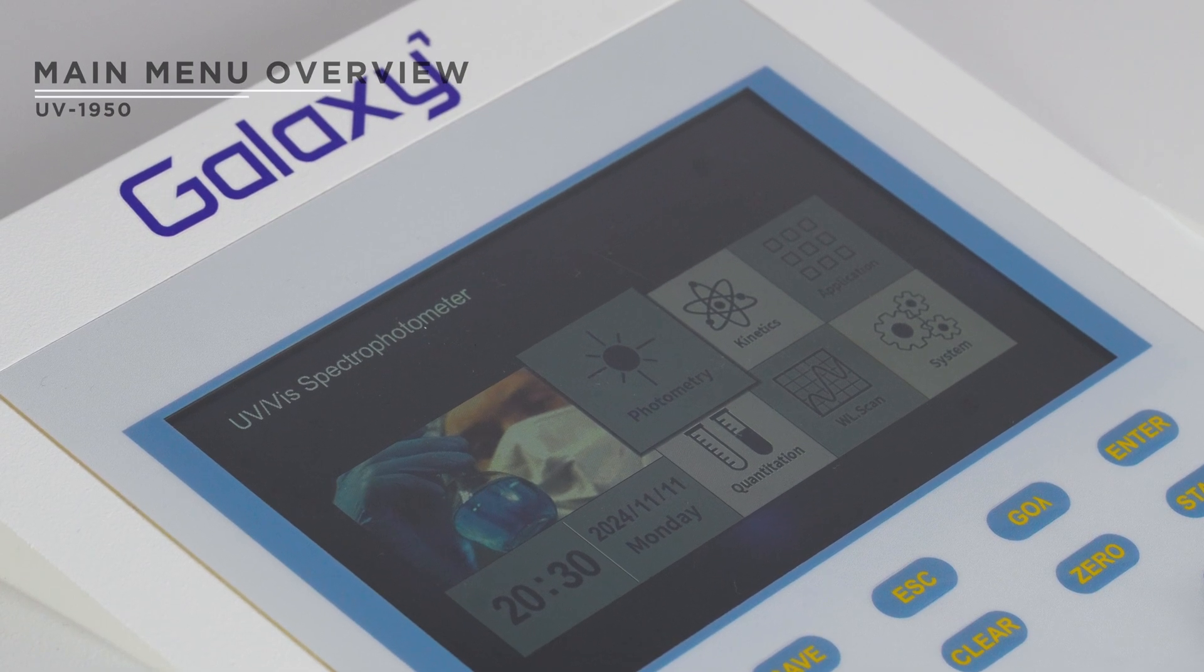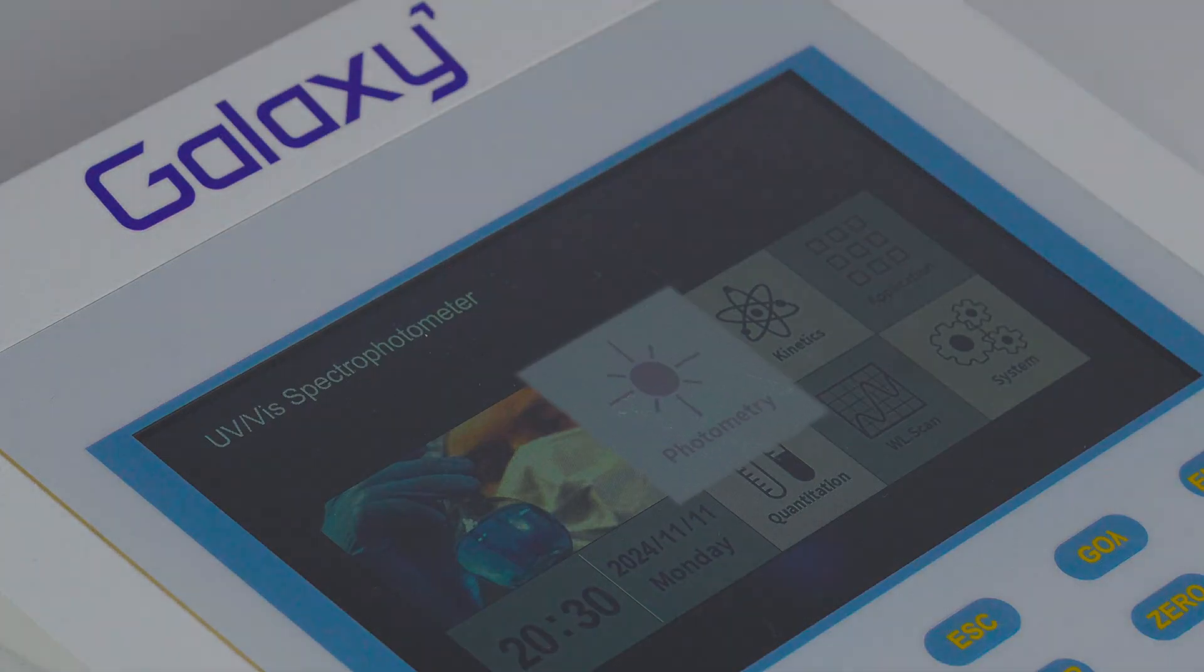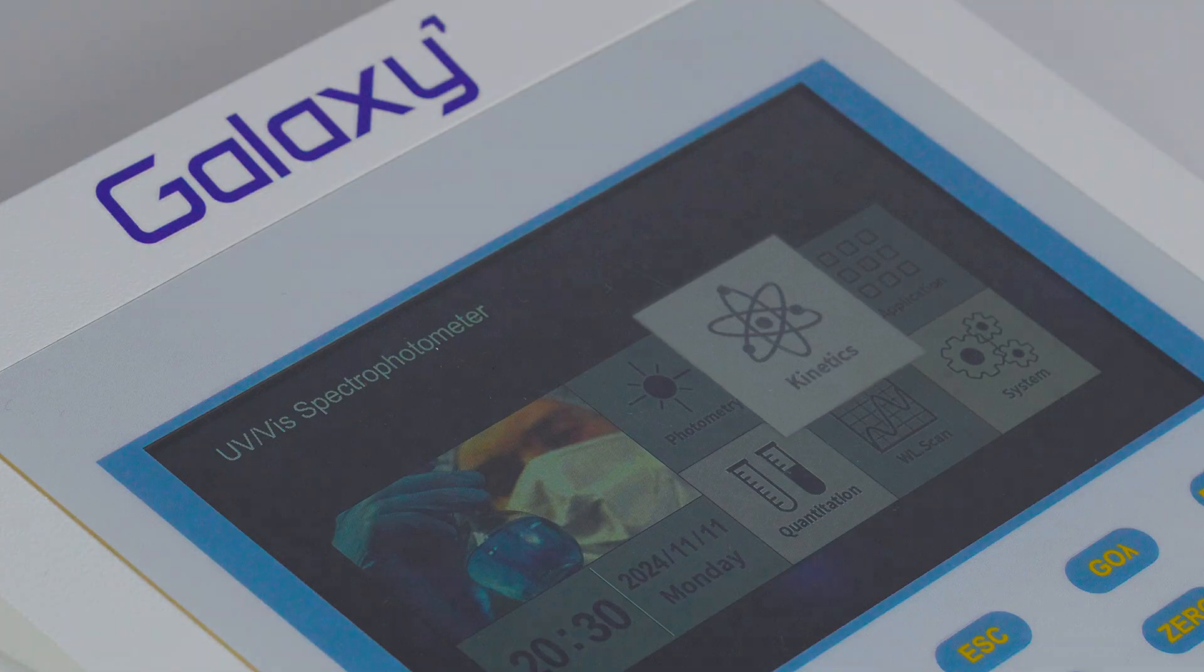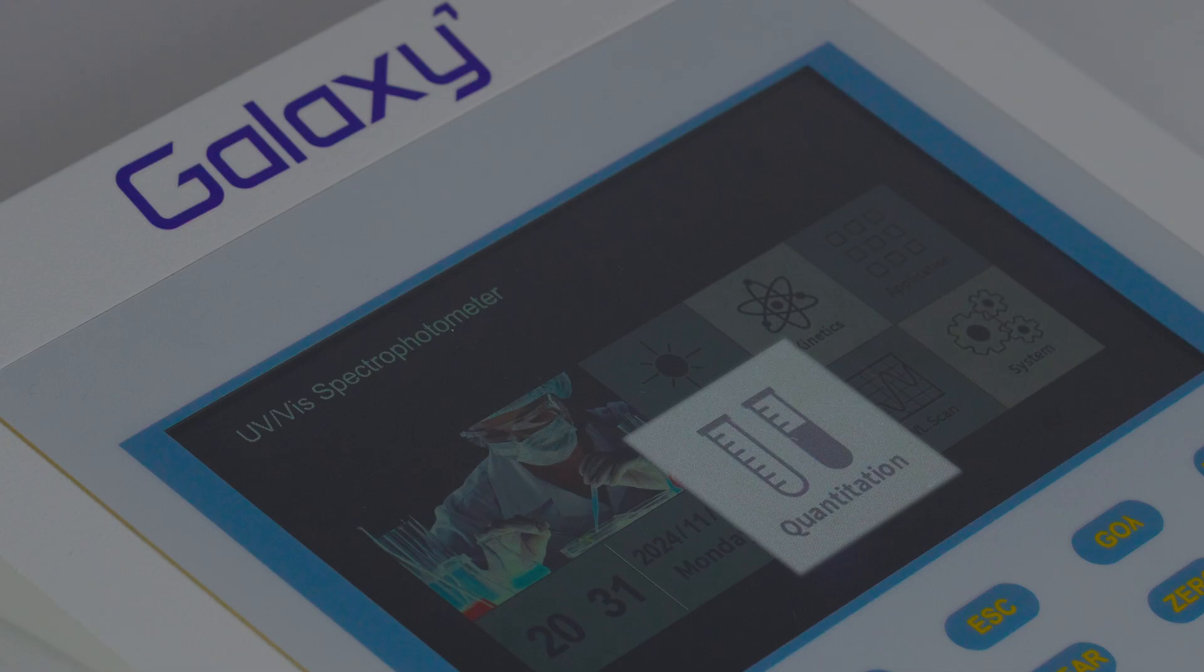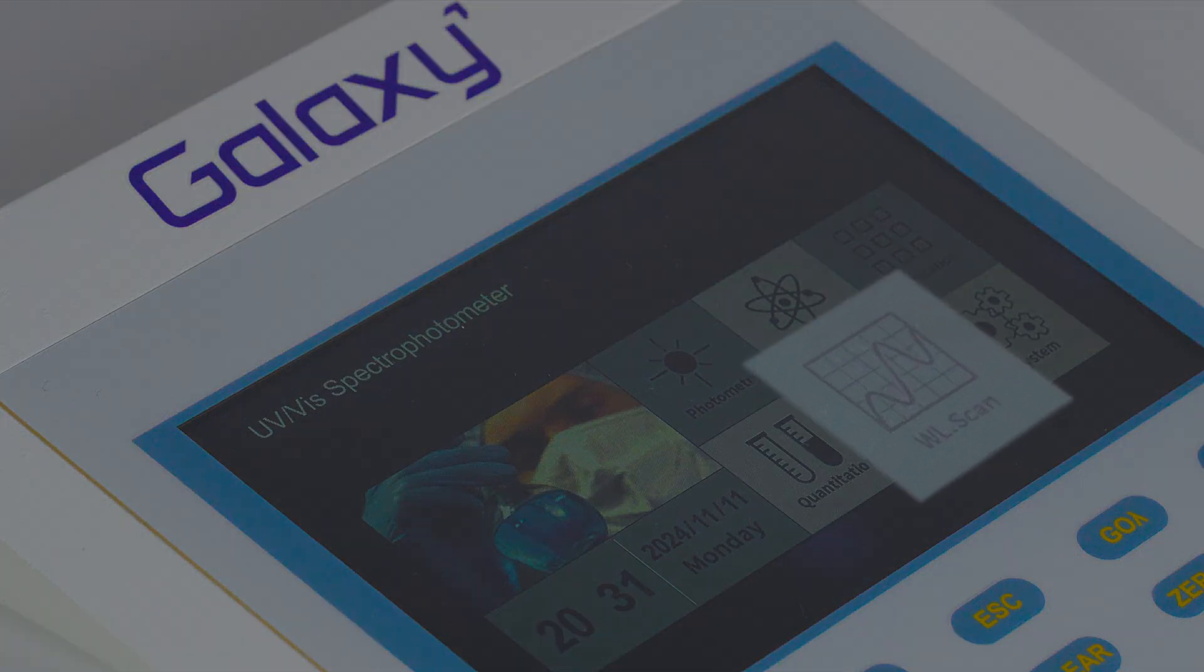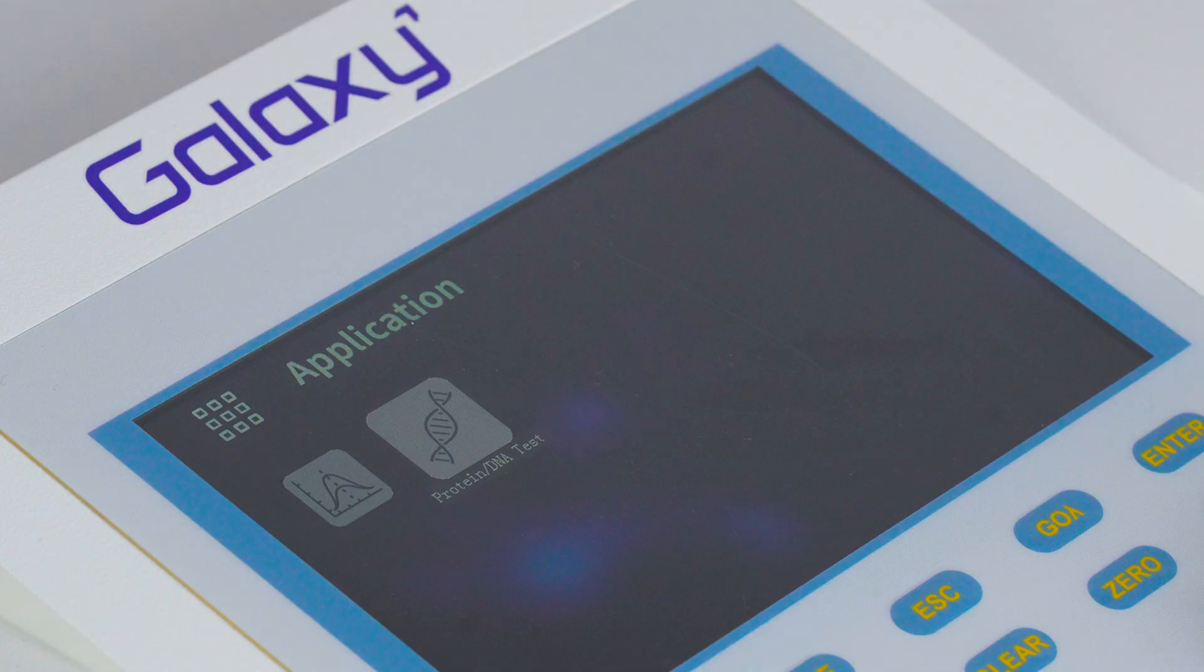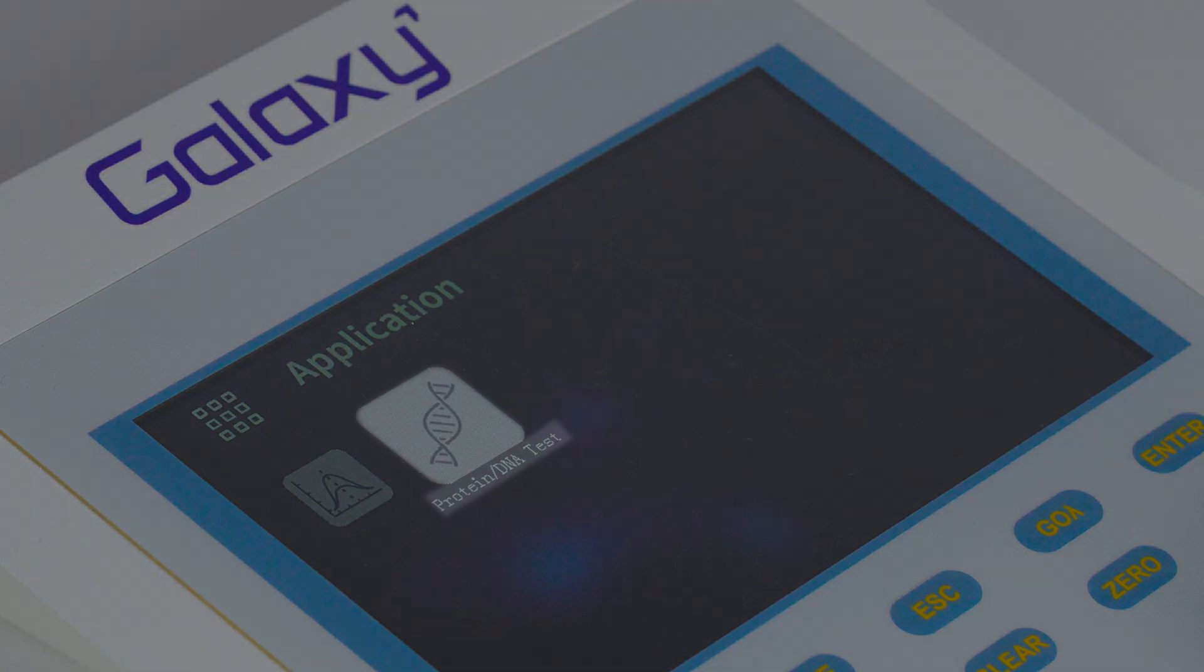The main menu offers several options, including photometry, kinetics, quantitation, wavelength scan, and multi-wavelength DNA and protein analysis. Let's explore each function.